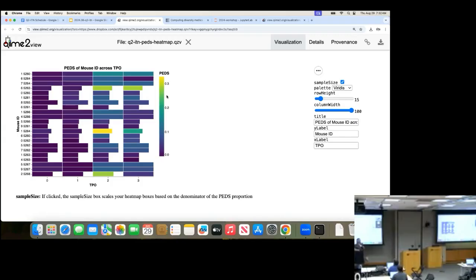It seems like they never engrafted any donor material. And so if they don't have positive clinical outcomes, I would not be that surprised, because it looks like they are not going to have positive clinical outcomes.